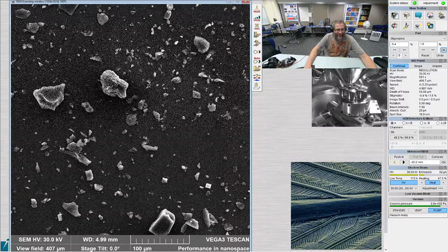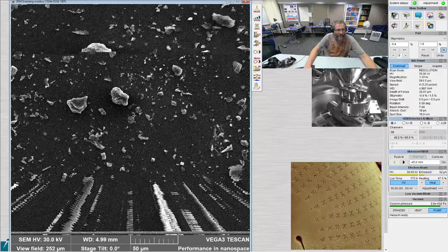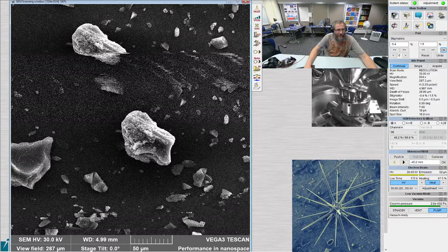I saw another one while we were zoomed out. Oh, I think we have from one of the last sessions an internal view of this guy with the Rimaportula down in that same. It's offset, but in that general region, yeah.